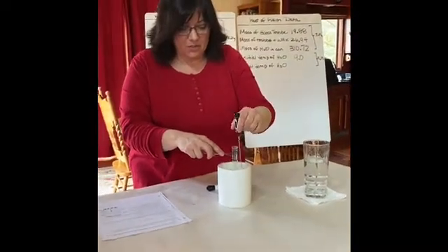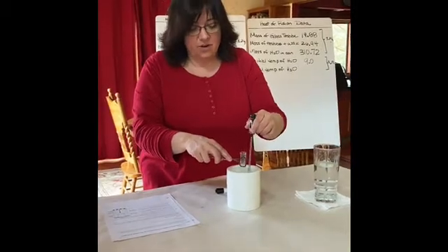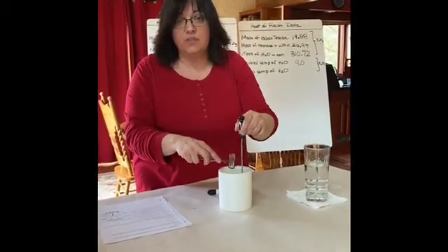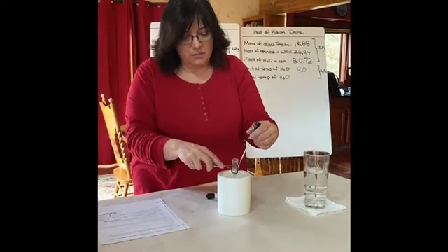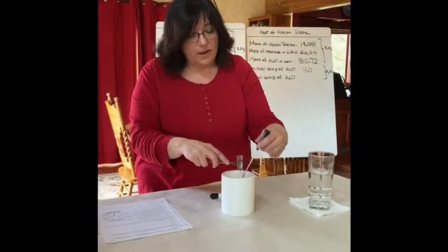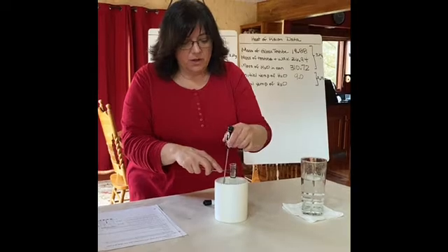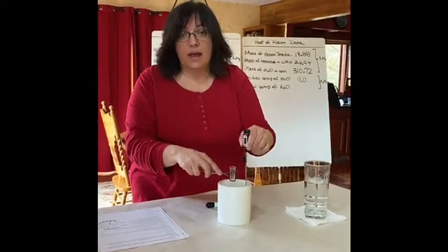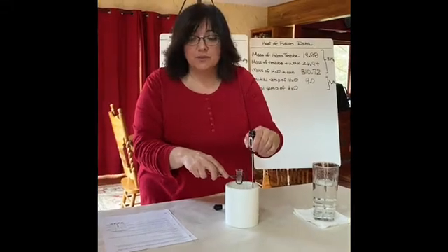But now what we wanna do is, as it freezes, it's gonna give off some energy because we've gotta reform those IMFs. So I'm gonna collect the temperature as it freezes. Right now I'm up to 9.8 degrees. This is gonna take a little while, so we'll come back when the temperature is stabilized. So we'll be back in a few.